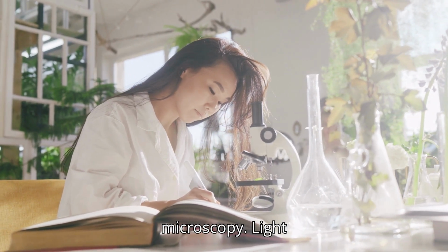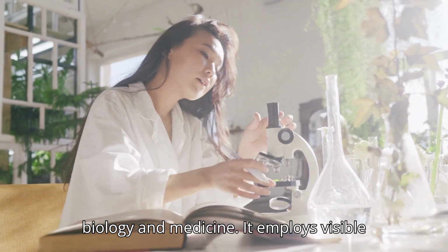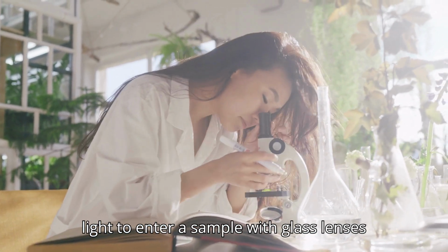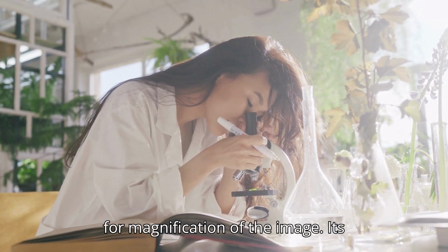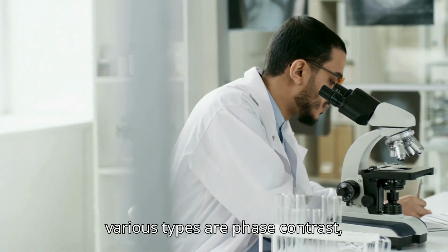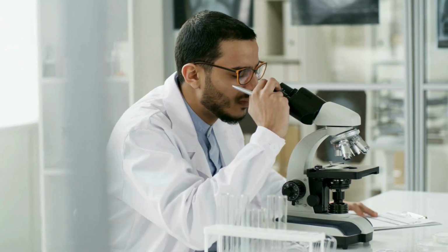Optical microscopy. Light microscopy is the most widely used in biology and medicine. It employs visible light to enter a sample with glass lenses for magnification of the image. Its various types are phase contrast, fluorescence, bright field, and dark field microscopy.